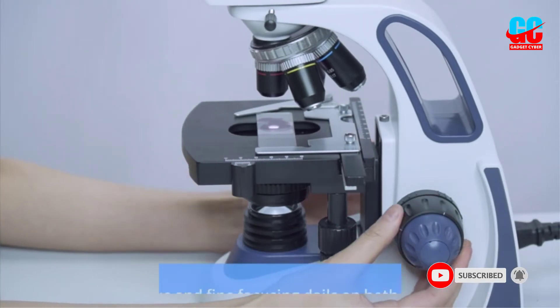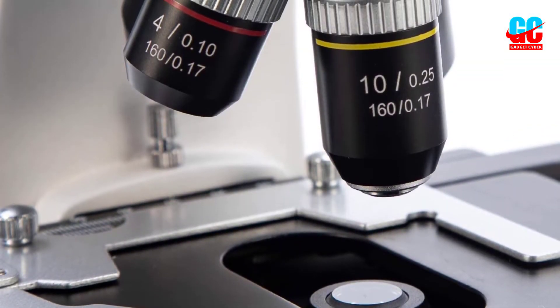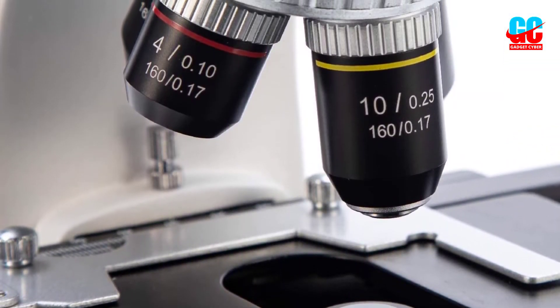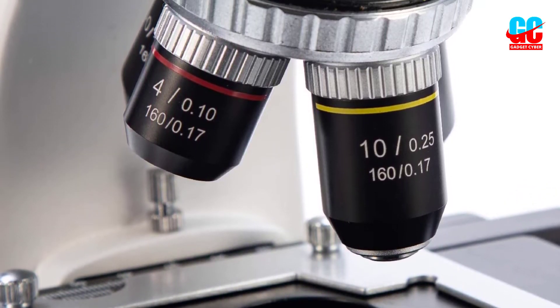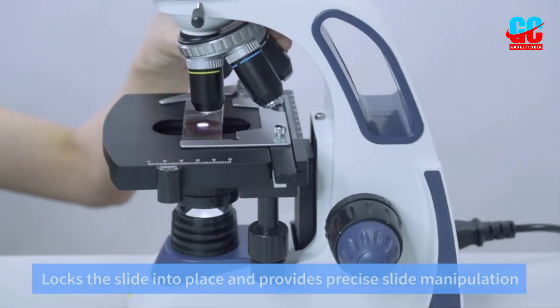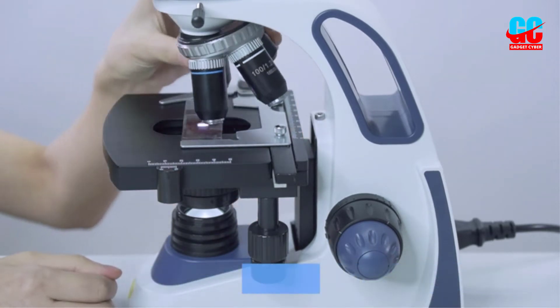Thanks to the dual 10x and 25x eyepieces, you get six different magnification levels ranging from 40x all the way up to 2500x, making this one of the most powerful microscopes that we tested. We were very impressed with the ease of focusing the Swift SW380T — the fine adjustment knob was very smooth and pulled things into focus very quickly, every time.